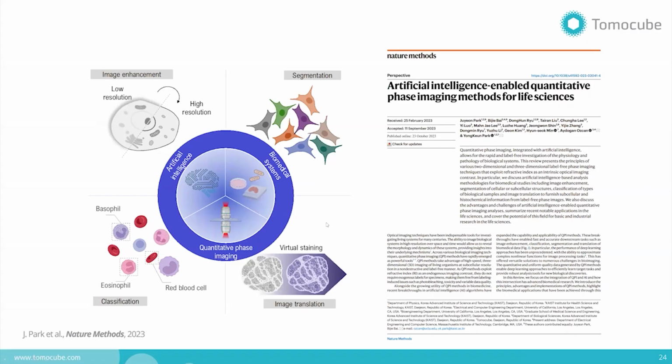From the last part, we have talked about the commercialization and the principle of HT, but this is an ongoing project. We are trying to find better applications of HT, and we realize the use of machine learning and AI is crucial, because we generate a new type of information about cell structures, and our data size is huge because we have high resolution, 3D imaging capability, and also long-term imaging.